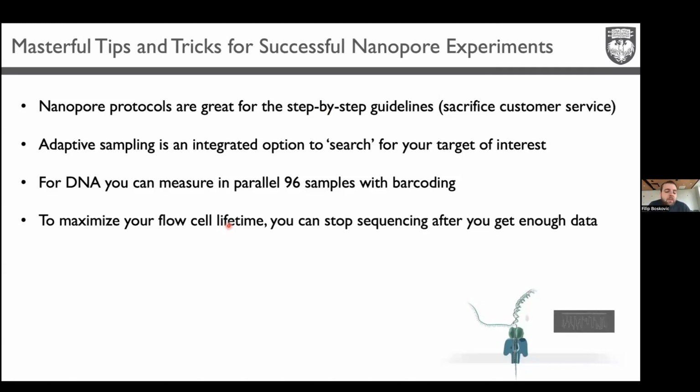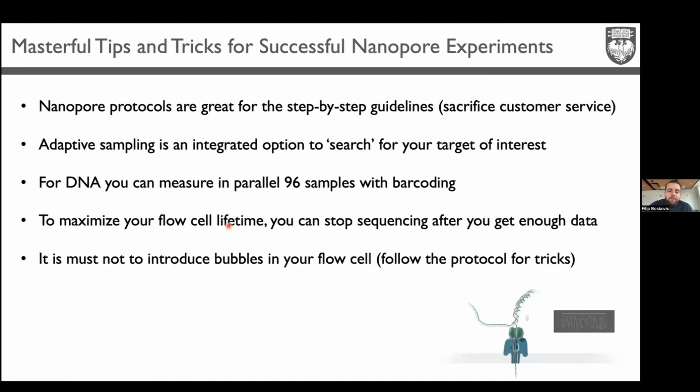So one thing if you're doing direct RNA sequencing and you're looking for modifications, one piece of advice and experience: usually the throughput is lower. They are now putting out a new flow cell, but it's not yet commercially available to everyone. This would actually increase the throughput, but you get less data, so you effectively need to measure longer. So basically per flow cell, you don't get a huge amount of gigabytes of data, you will get less. So keep that in mind.